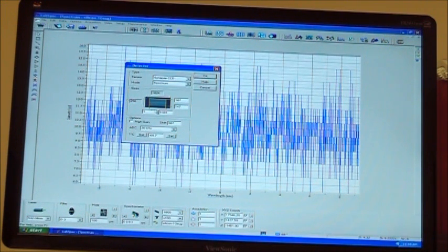Okay. Down at the bottom, it says TC. Right now it says minus 69.7. Most labs usually are anywhere between 20 and 24 degrees. So if I was to shut the system down to warm it up, you would open this detector window for shutting the system down, and you come in here and you would actually set this number to 20 and then hit set. And then you would leave this window open and monitor the detector temperature until it gets to positive 20. Once it hits about positive 20, the detector then is safe to power off.